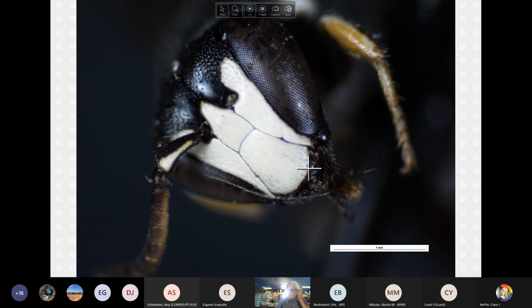Sometimes the other specimens turn from yellow to more of an off-white. So when you see this, you should be alerted that you're probably looking at one of the non-native species, although I think maybe Schwartzii has a white aspect to the colors on the front too. I'm not 100% sure. Here we see a scape. In this case there is no scape or antenna over there, but you can see it's relatively thin. It does have this white marking here. There are probably some other characteristics.